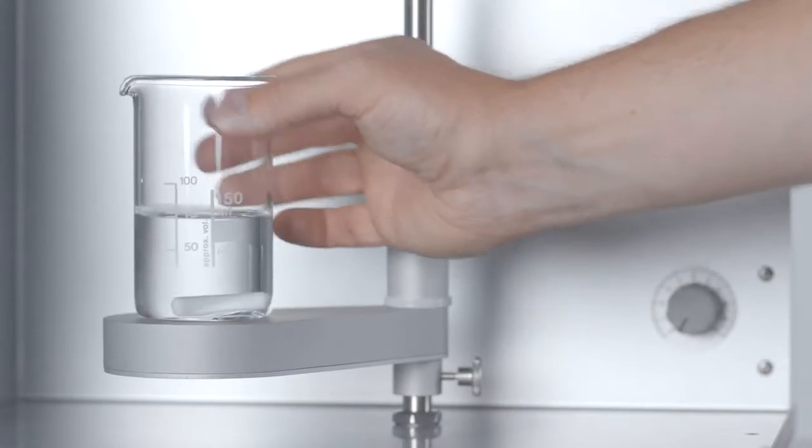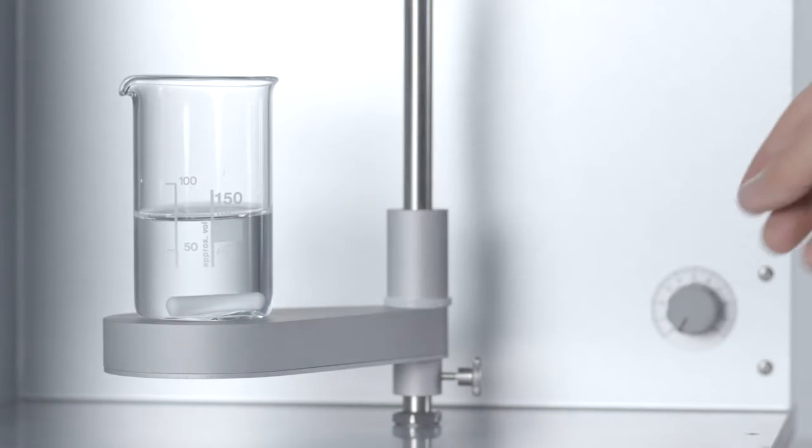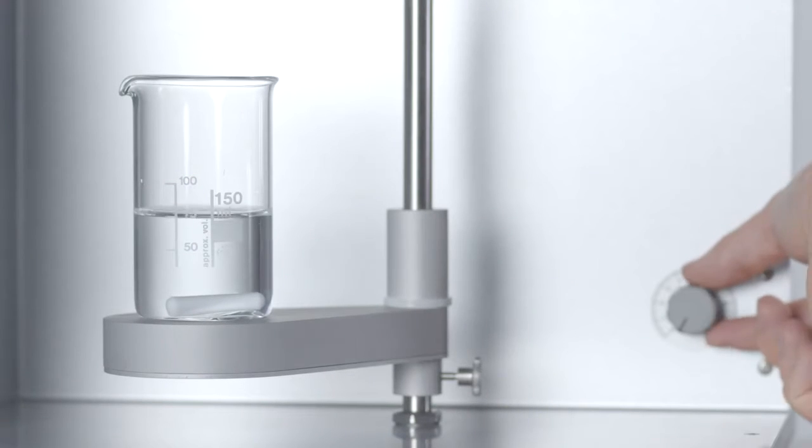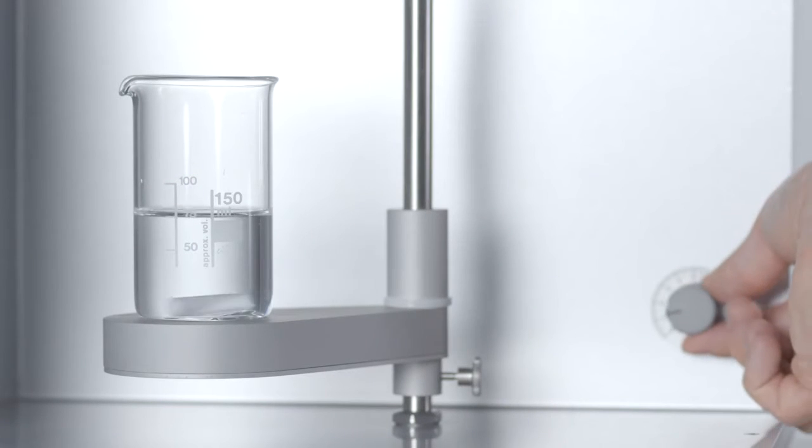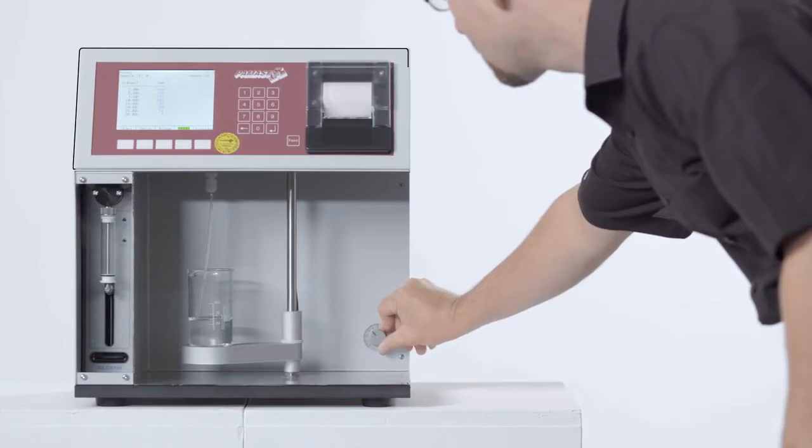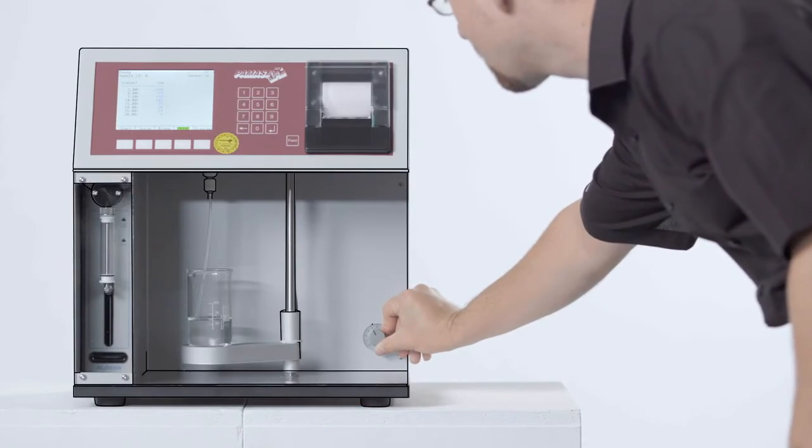An integrated magnetic stirrer guarantees that the particles are thoroughly and homogeneously distributed.